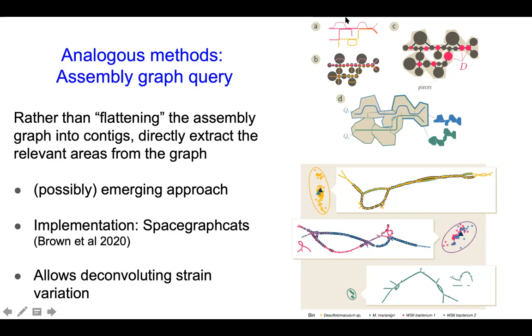The images on the right show a part of how that graph partitioning would work. At the top and at the bottom are representations of the graph. And the dot plot insets show variable amino acid sequences as assembled by an amino acid assembler. What you see on the graph pictures, so top right, middle left, bottom right, is that there are a lot of these loose ends.